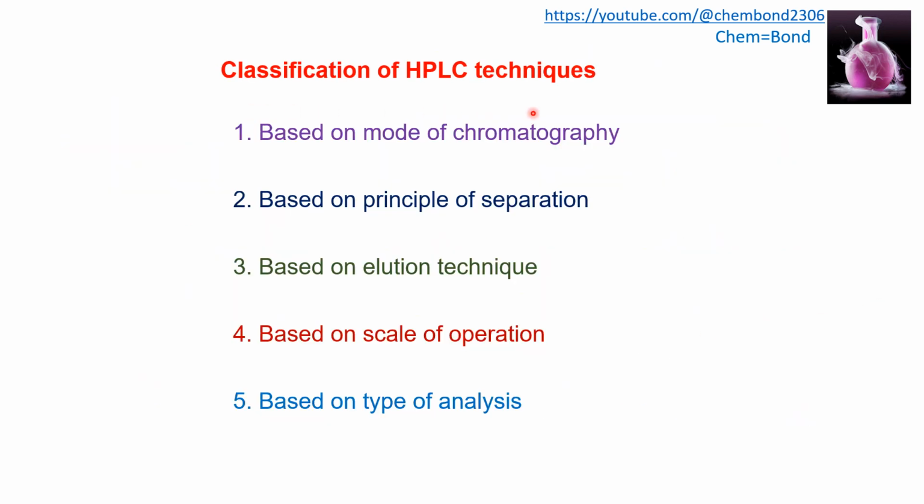Classification of HPLC technique. It is based on mode of chromatography, based on principle of separation, based on elution technique, based on scale of operation and based on type of analysis.